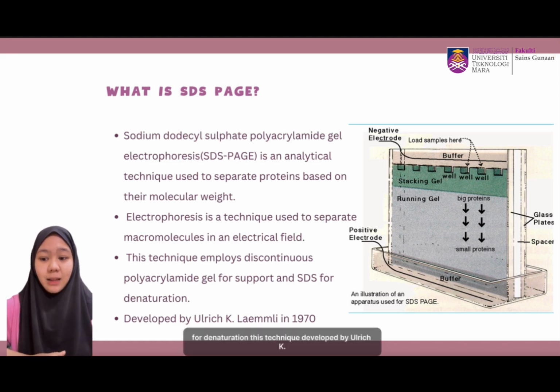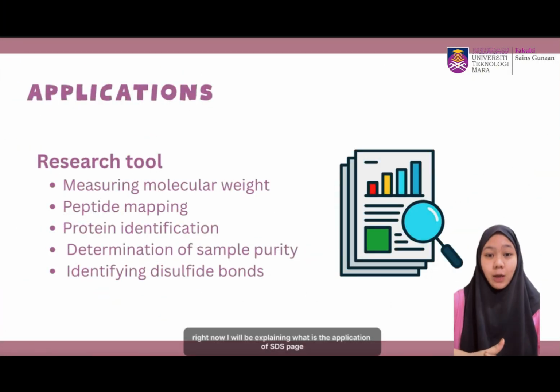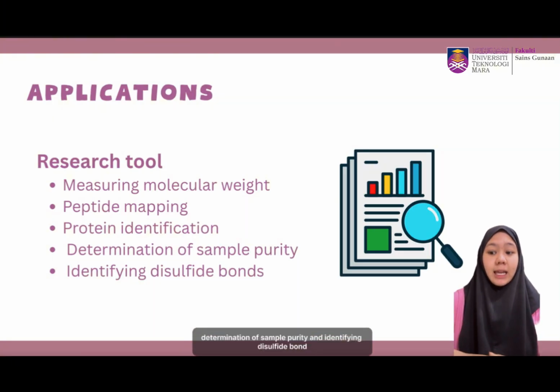This technique was developed by Ulrich K. Laemmli in 1970. Right now, I will be explaining the application of SDS-PAGE. SDS-PAGE is mainly used as a research tool. It can measure molecular weight, peptide mapping, protein identification, determination of sample purity, and identifying disulfide bonds.